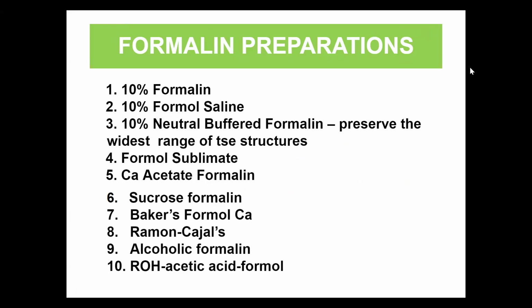So we have different preparations for formalin. You have your 10% formalin, of course, your 10% neutral buffered formalin, which preserves the widest range of tissue structures. You also have your formol sublimate, calcium acetate formalin, and so on. So different concentrations of formalin are being used with these different solutions.